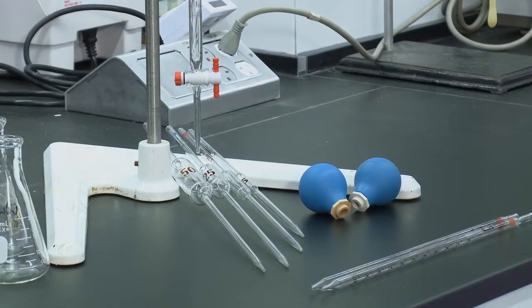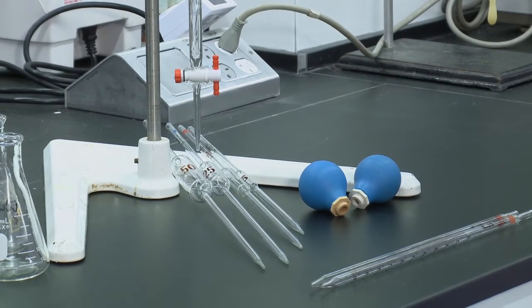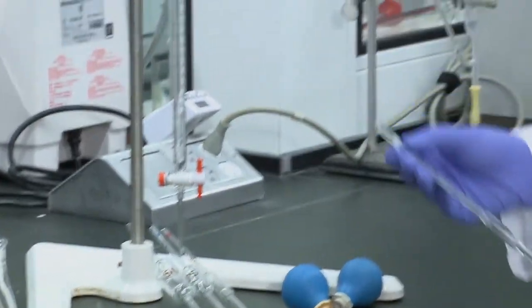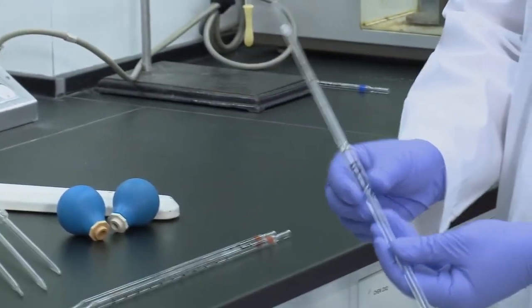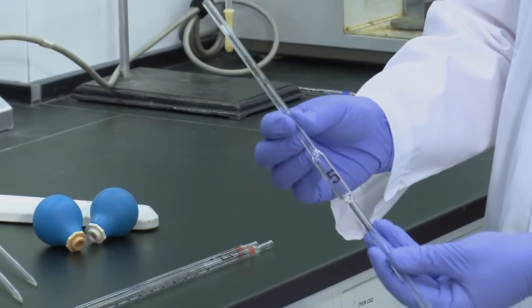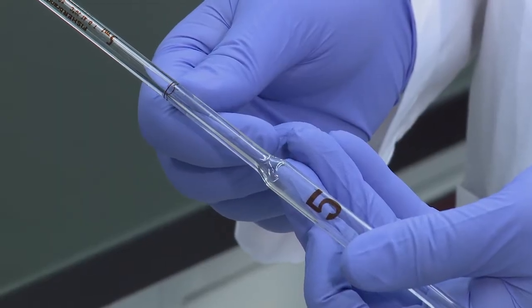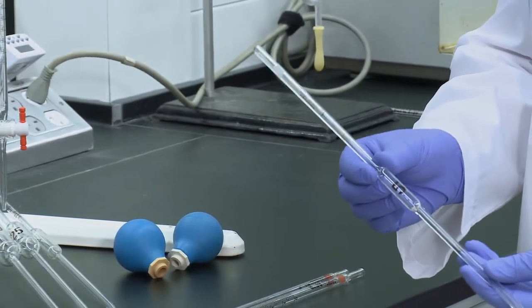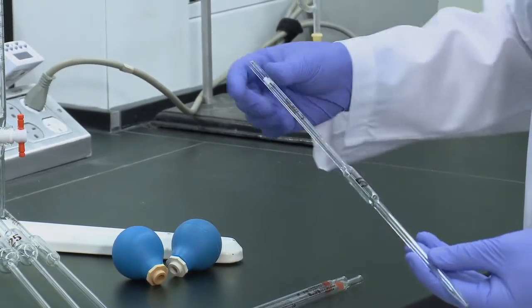There are several different ways we transfer accurate volumes in this lab. Most commonly you'll want to use your transfer pipettes which have the indicated volume on them and a single line like the volumetric flasks. These are the most accurate means you have to transfer volumes in this lab.